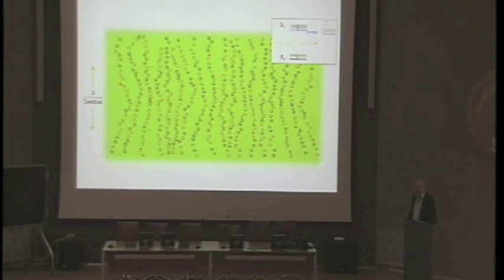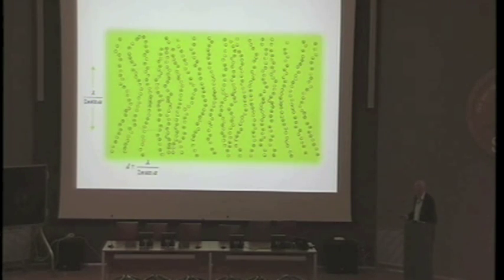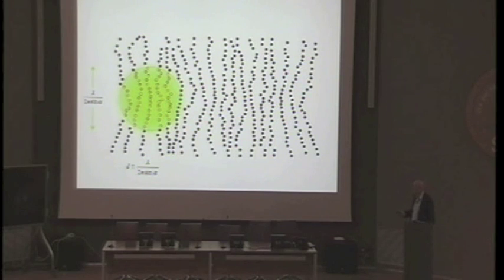Now, it has always been clear that you can separate features that are further away than the diffraction barrier, no doubt. Because they're further away, no problem. The problem of resolution exists only within a limited range. So we cannot separate this from this and this from that, simply because it's closer than the diffraction barrier. You see now that this is the typical barrier, the distance about 250 nanometers, or this is the diameter, and we cannot separate this from this, and this from this, and this from that.